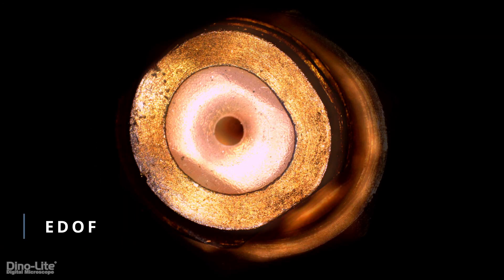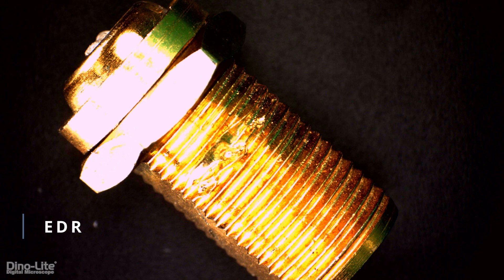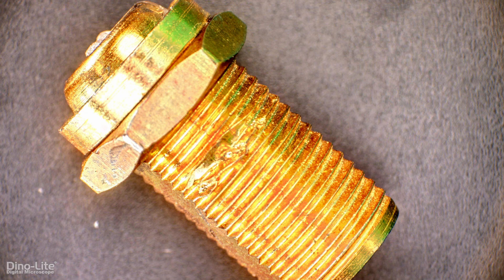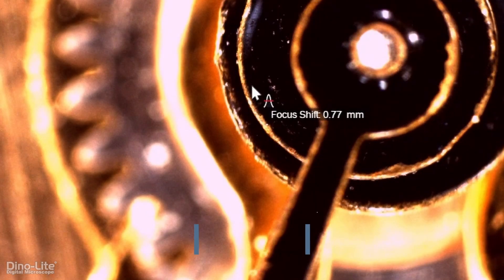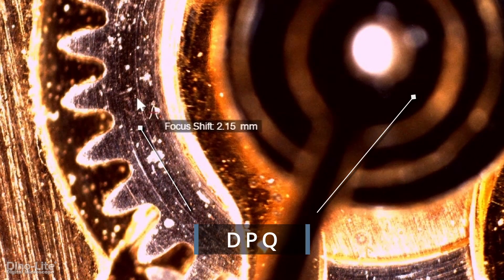Enhanced Depth of Field quickly and easily creates focus stacked images. Enhanced Dynamic Range quickly and easily creates exposure stacked images. Depth Acquisition precisely reports the focus shift distance to allow you to gather depth information.